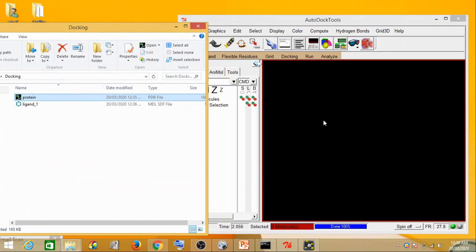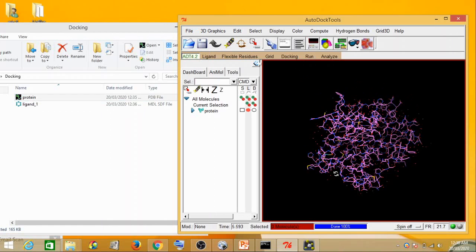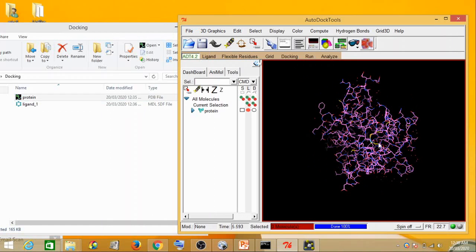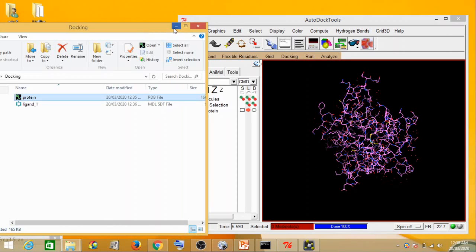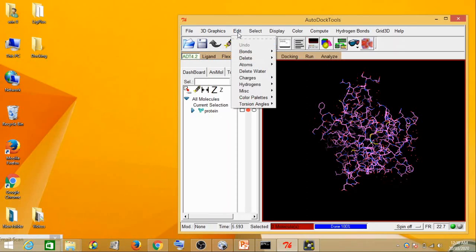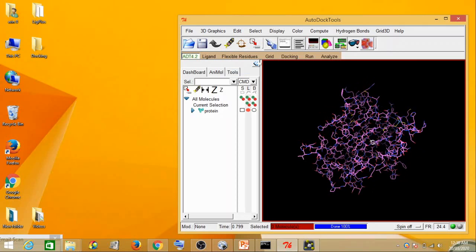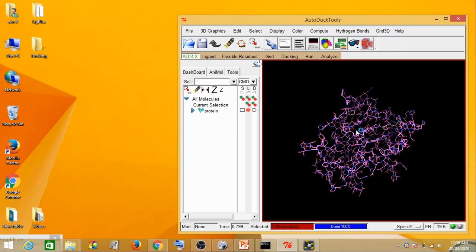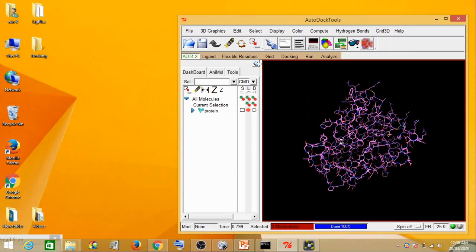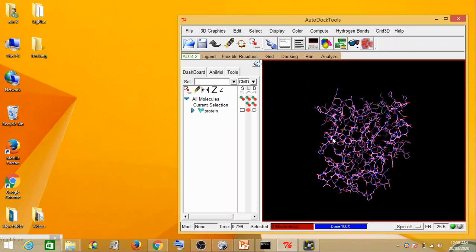We take this protein and drag and drop it into AutoDock MGL Tools. To carry out protein preparation, the first step is you go to Edit and delete all the water molecules which are present. The reason for deleting all the water molecules is that if you have water molecules in your pocket region, they could interfere with the docking — your ligand would not comfortably sit in the pocket region.